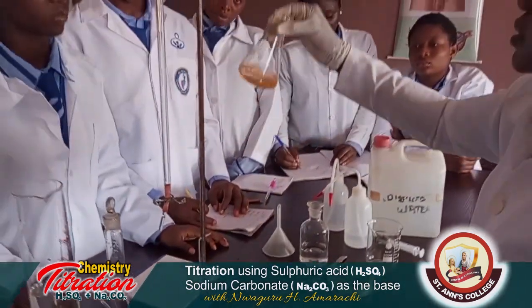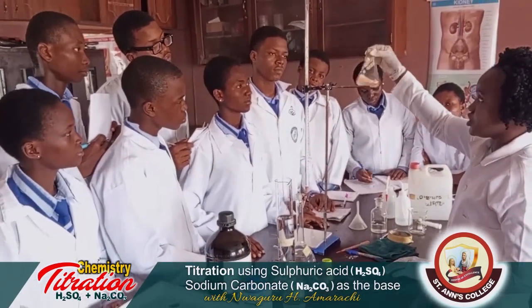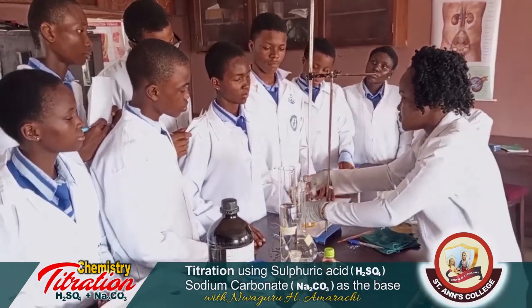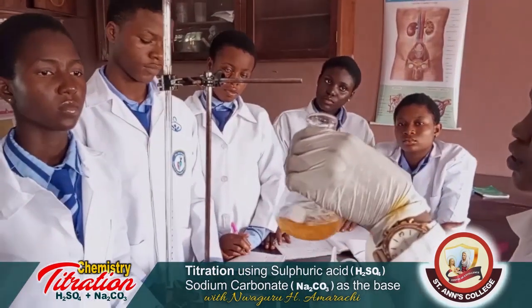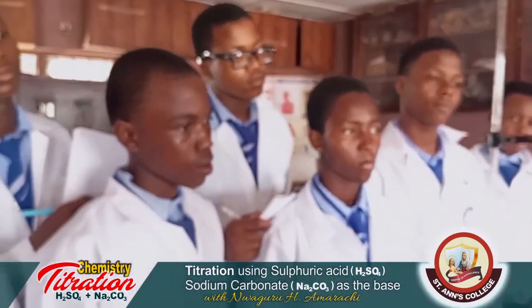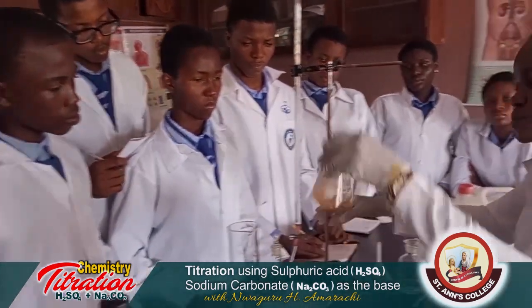Now, as the acid is dropping, you watch the color change. You can see there is a color change. So you watch carefully. The first experiment, we normally call it rough, because we are trying to get the exact change or end point of the reaction. So we watch and add some drops of acid.